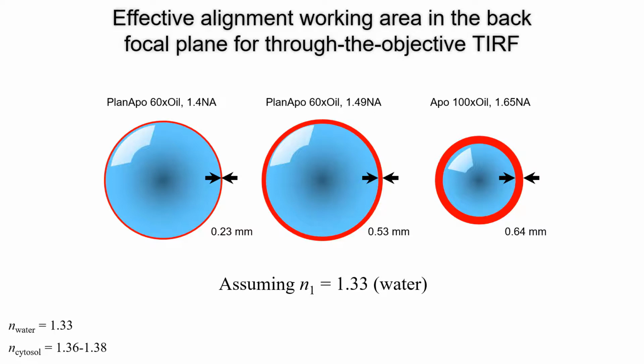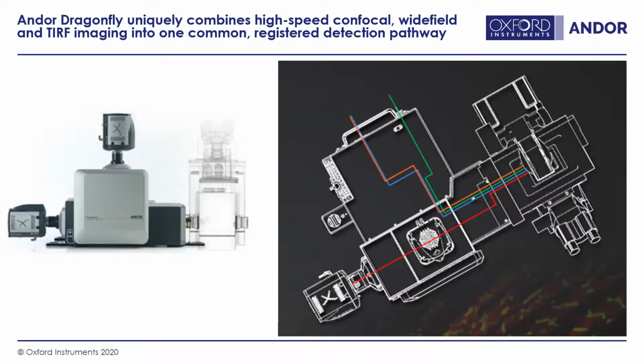However, it should also be noted that objective lenses like these require volatile and toxic immersion oil that can be corrosive, and the cover slips are expensive because they must be made out of sapphire, which has an index of refraction equal to 1.78.